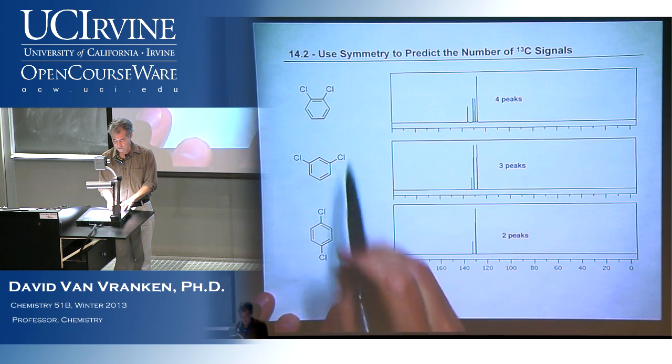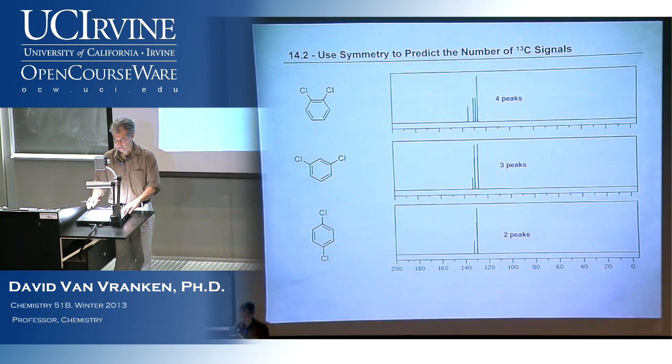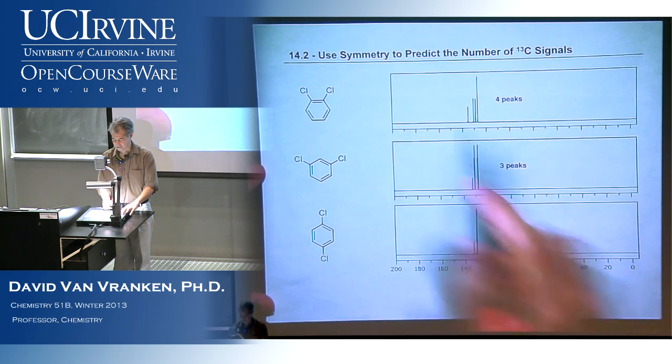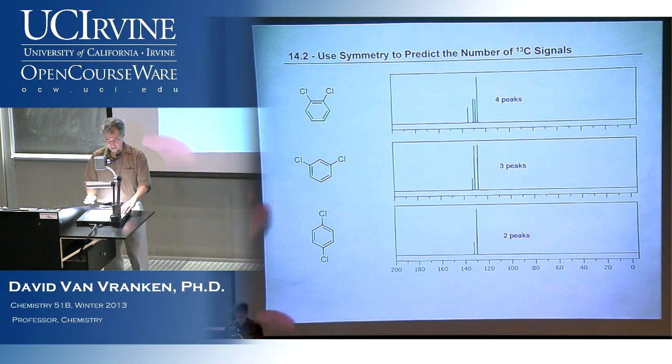Okay, so let's start off up here in the top. How many different signals would you expect to see for the top compound? Would somebody like to answer? It's not matched to the spectra on the side. Yeah, I'd expect to see 3.